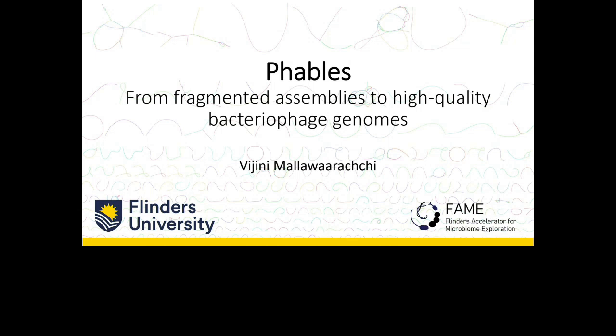I'm going to talk about something totally different now, and it's about a bioinformatics tool I have developed to recover bacteriophages from environmental samples.